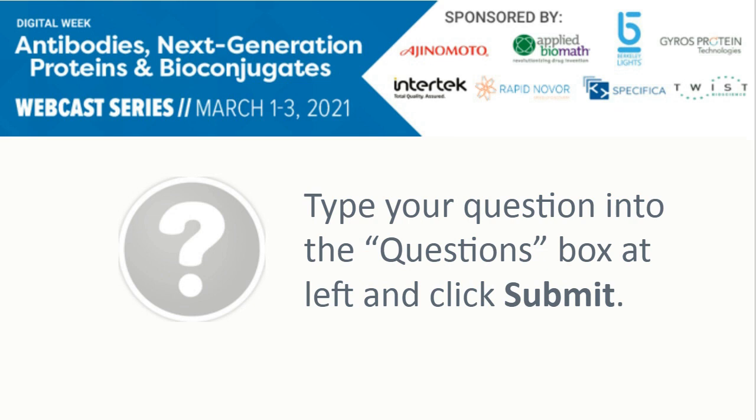Great, thank you. Next question. Is it possible for RePAB to work through providing affinity purified material and the peptide of interest? This would allow for immunization, and then collected antibodies could be compared back to the affinity purified material. Sorry, I'm just going to read this one. It's a bit of a long question. Possible to read that? Sure.